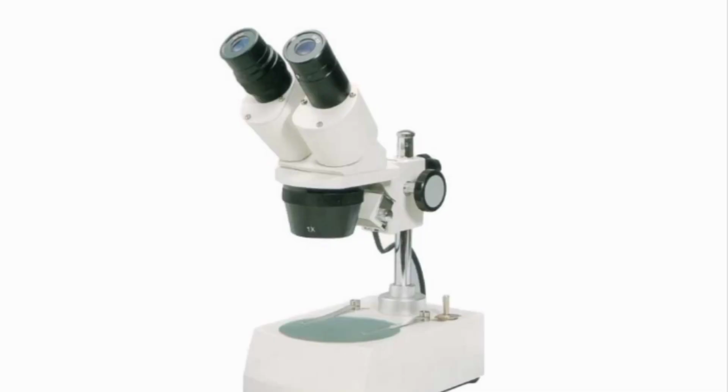You can see the picture of a stereo microscope and also master the similarities between a stereo microscope and a compound binocular microscope. You can see that both of them have two ocular lenses with 10 times magnification. All right, so next slide.